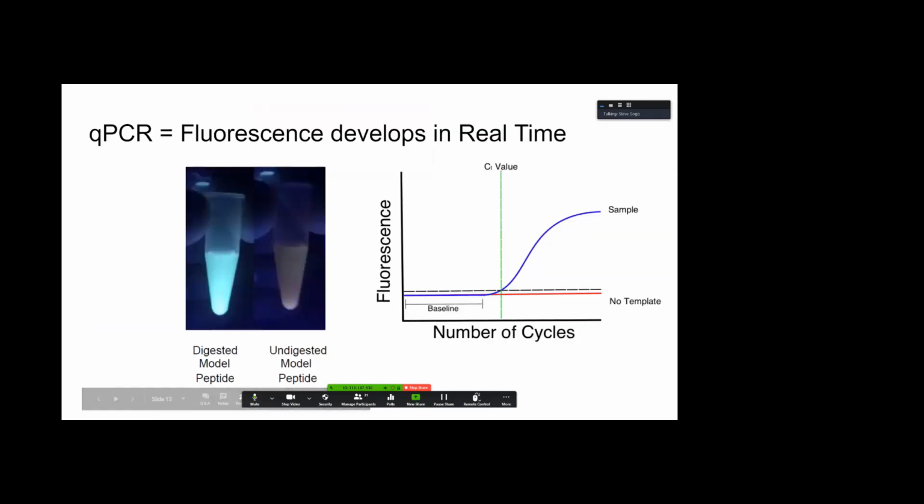So that is called qPCR, and the Q is for quantitative. This relies on fluorescence. This picture is from ACR; I think it's Joey Ravenna's picture. David Wong also worked on this project, so he'll recognize what this is.